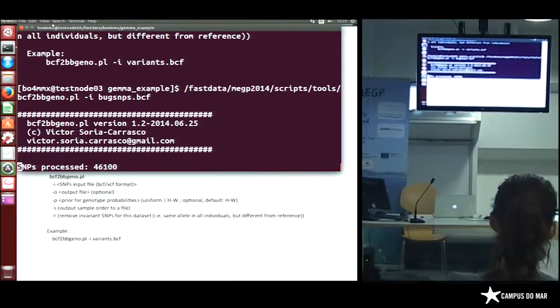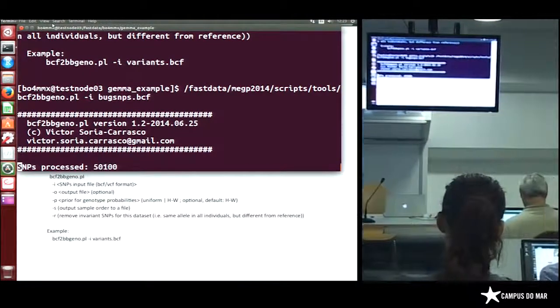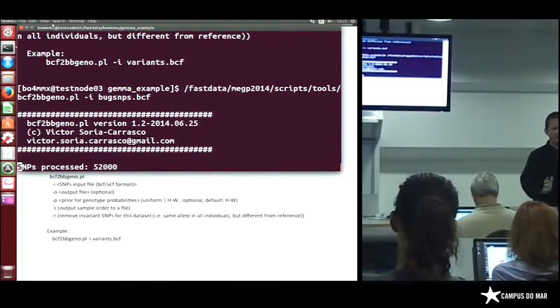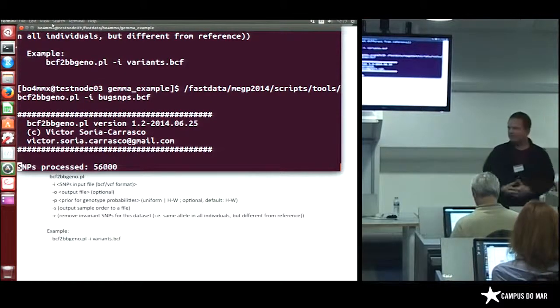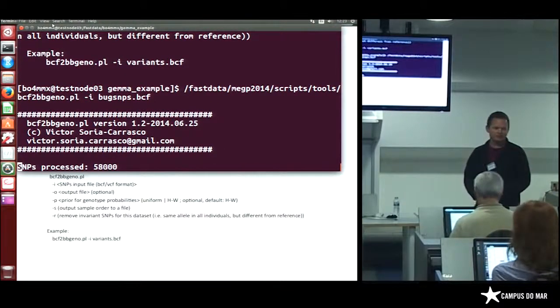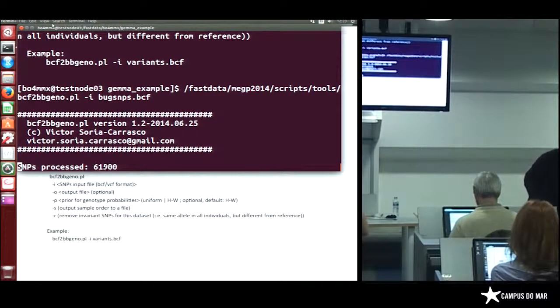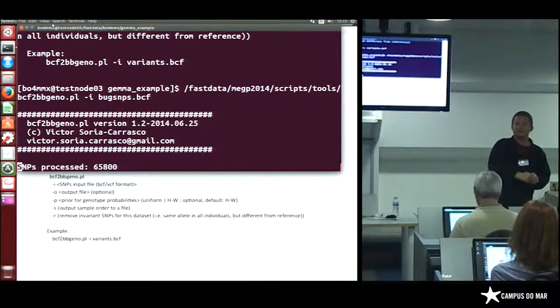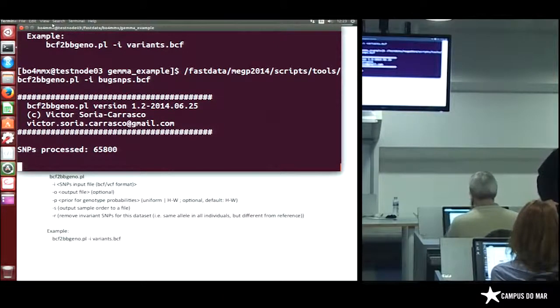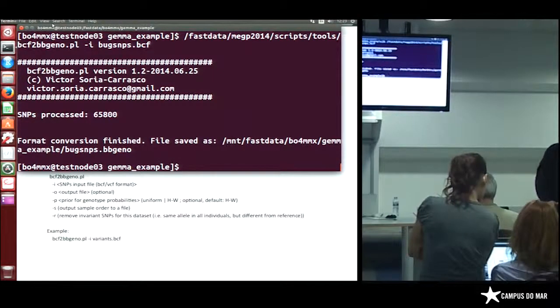Make sure you're not in the head node. If your command prompt says that you're in login 1, that means you're actually in the head node of Iceberg. So you need to type QRSH and move away from the head node to actually access. And then you need to change directory back into. Okay, yeah. So somebody else will help you. Oh, no, you don't need any more SSHs, no. You're in. You can just CD space /fast data.